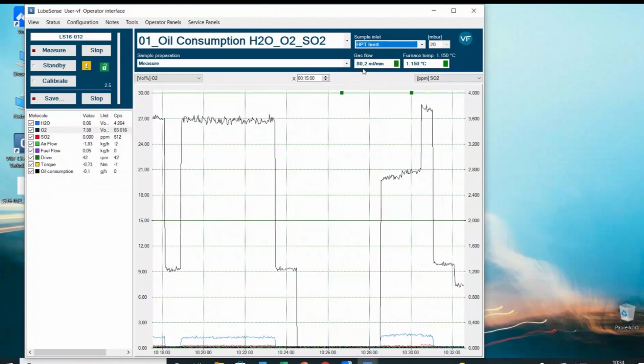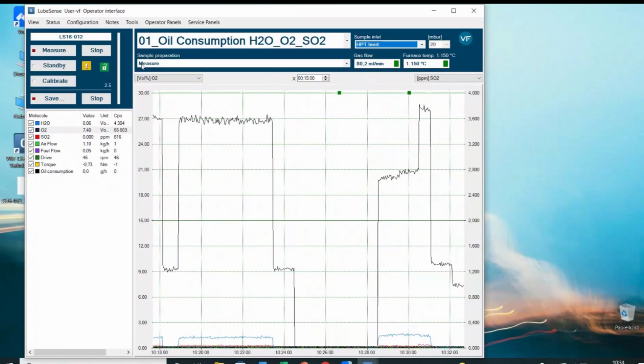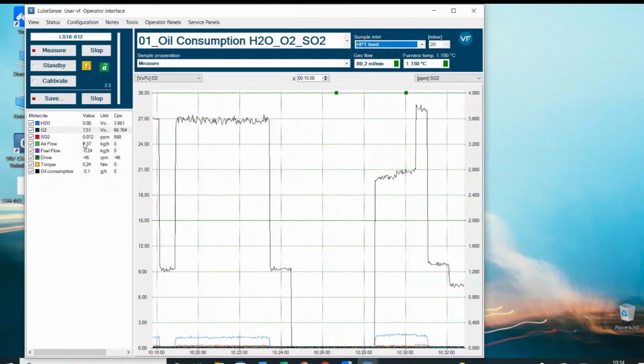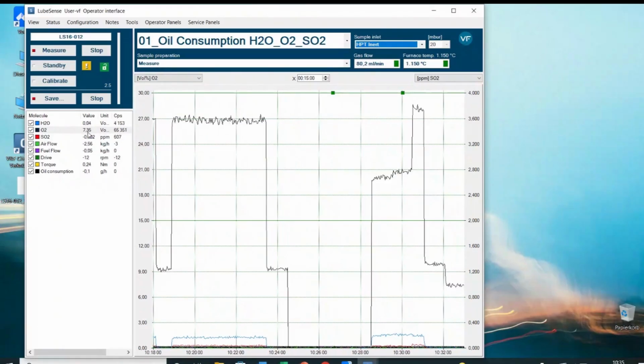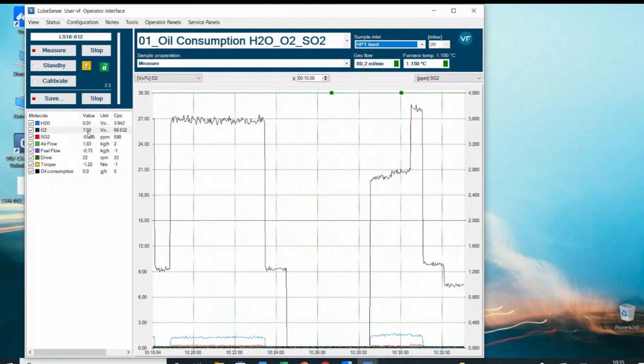So once you have done the oxygen calibration, you should always check, while the gas oxidizer is in measure mode, that the oxygen value that you get for 100% nitrogen gas is at around 10 volume%. And like it is now, this is not the case. So right now we only have 7.4, 7.2%.